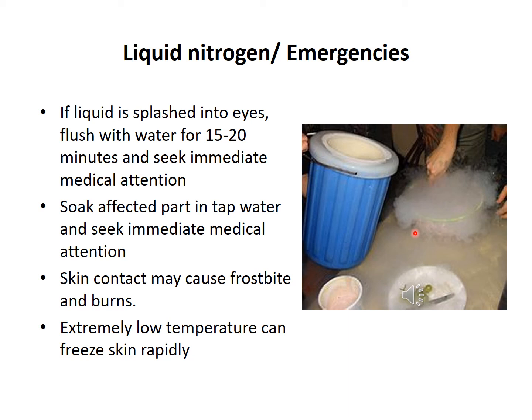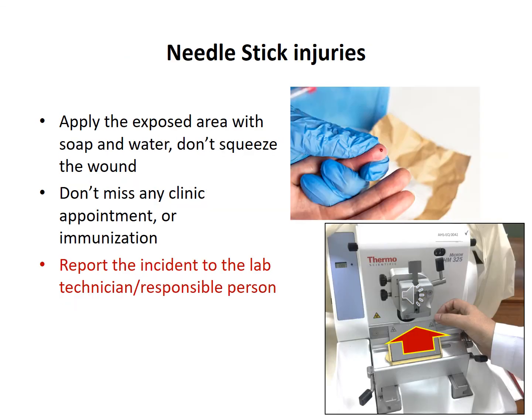And of course, this low temperature can cause your skin to freeze very rapidly. So be careful if you are using liquid nitrogen. Although this is a very common chemical, and most of the students have to work with it, it is also very sensitive to work with.